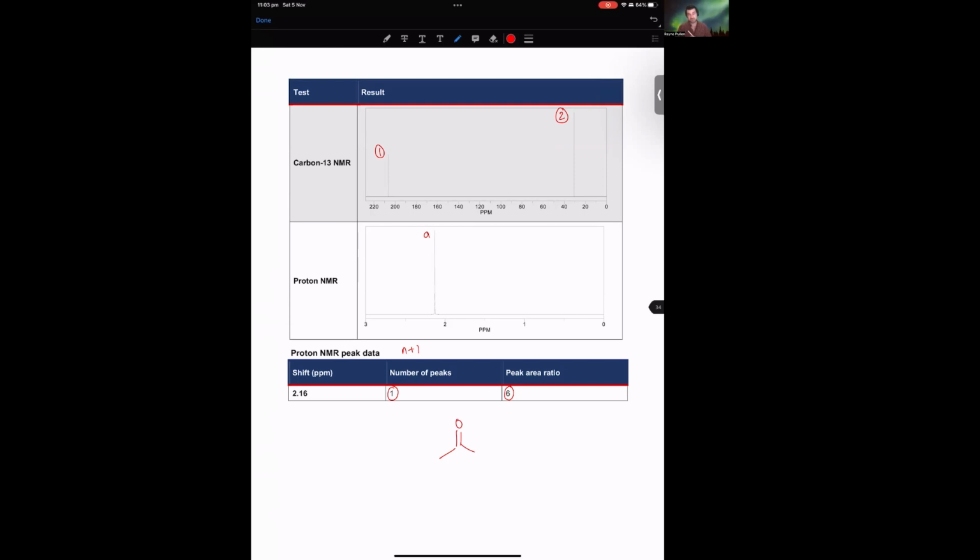The carbon connected to the ketone has no proton, so the 2 CH3s have no proton environments next to them, and therefore the singlet for their peak. If we take a different color and draw a dotted line, we can see that it's symmetrical. Because it's symmetrical, those 2 proton environments are equivalent to one another, which is why we see the 1 peak and a ratio of 6.